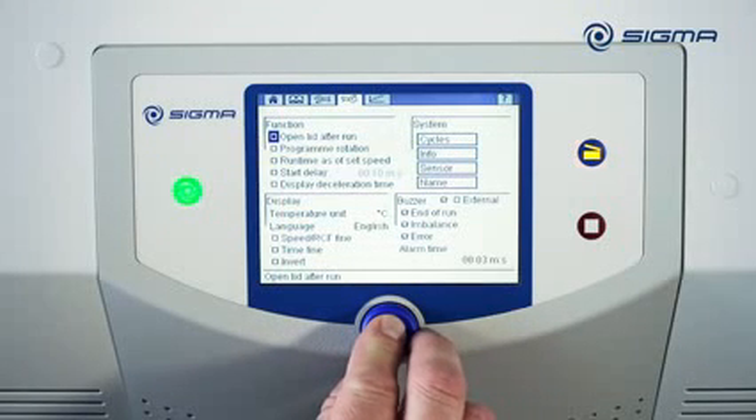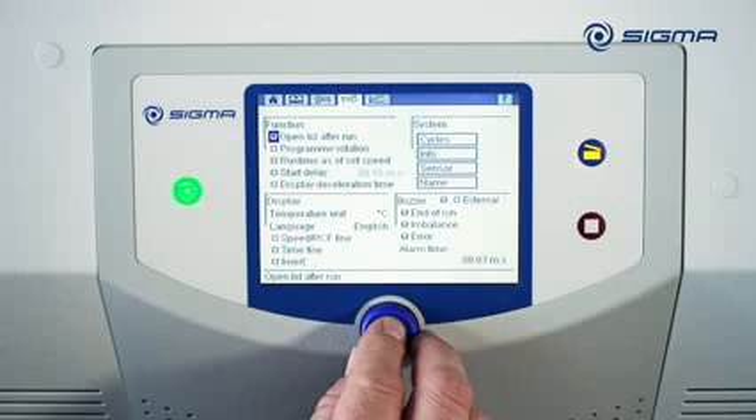If the Open Lid After Run option is enabled, the lid lock is released at the end of the run. You should bear in mind that the refrigeration stops running when the lid is open.